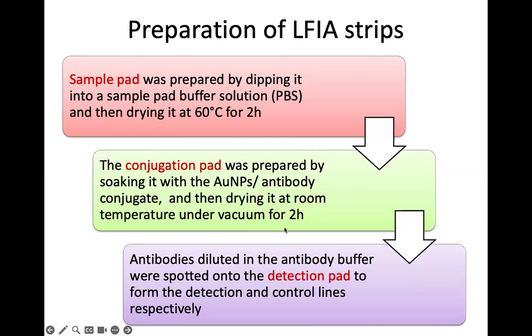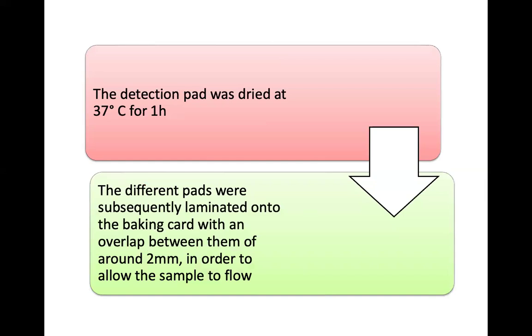So you may ask Dr. Hafiz or Dr. Ain tomorrow how sensitive it is towards the moisture of the room condition. Because if it is damaged due to moisture effect, then the whole thing will not be usable. The lateral flow will be damaged if it is exposed to moisture. So that's why the preparation room has to be in dry condition. It's not a clean room, but it's dry condition.